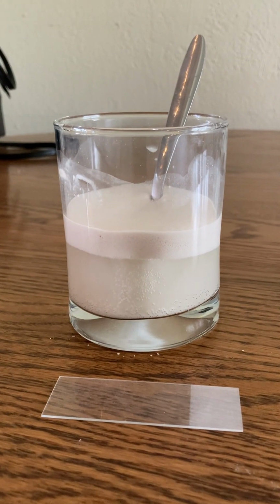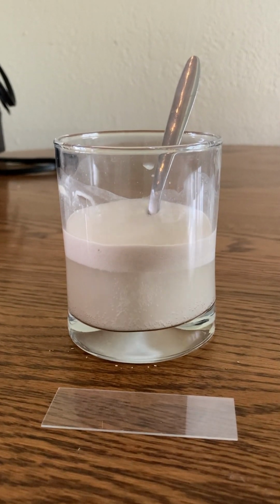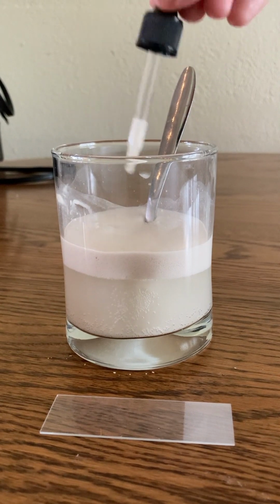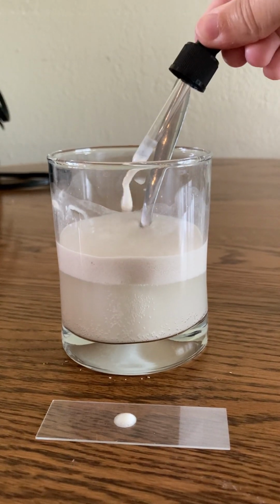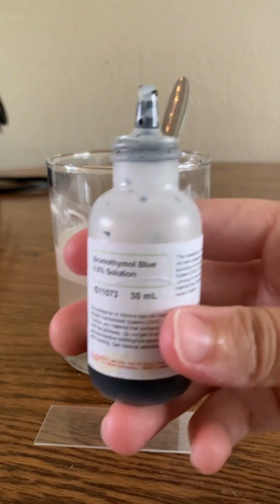After several minutes, I know that the yeast is living because I see a layer of foam bubbles at the top of the glass from the carbon dioxide that's produced as the yeast ferments. It's going to smell a little bit like bread dough. To get a closer look at the actual yeast cells, I will put a drop of the yeast water solution on a microscope plate along with a drop of bromothymol blue cell stain.